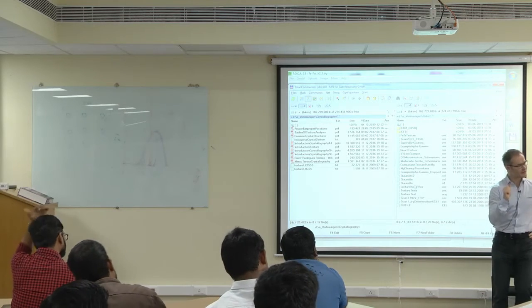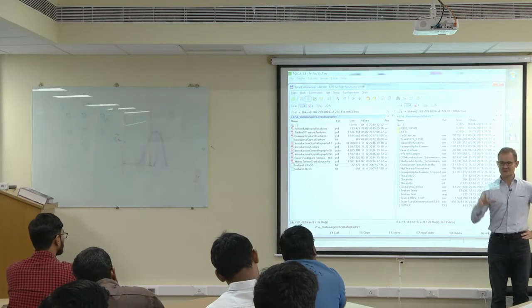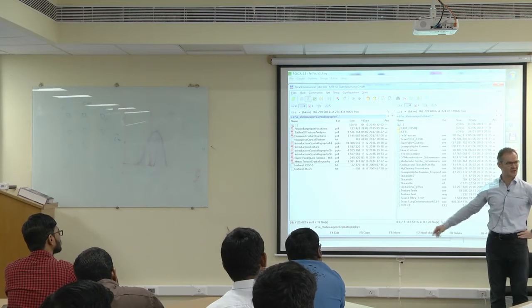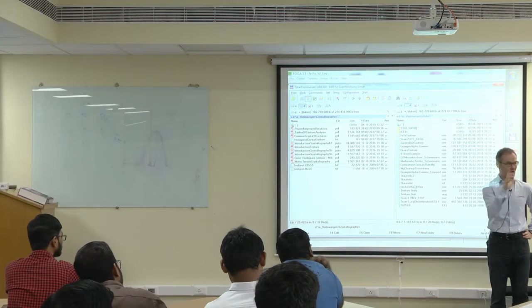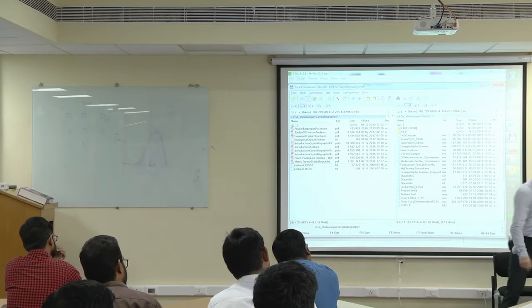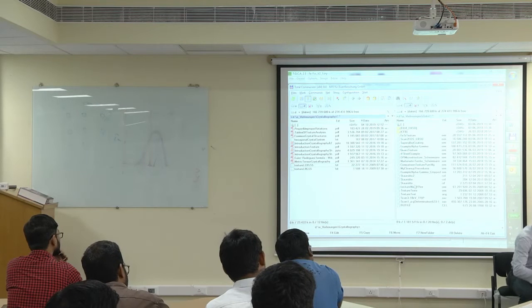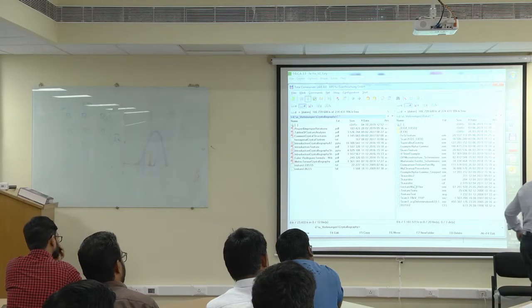And later on I can also speak a little bit about EBSD as a technique in general. But now we will use a little bit of texture analysis with the OIM software to look at what we can do with it and how we handle it. That means, however, that I need a proper place where I can see these guys and my computer.